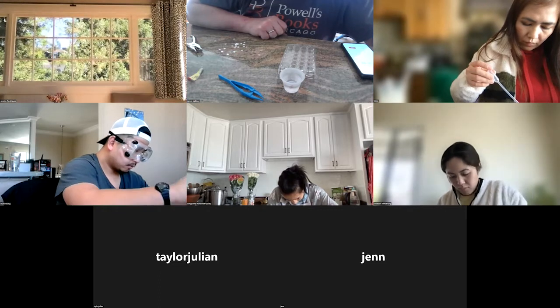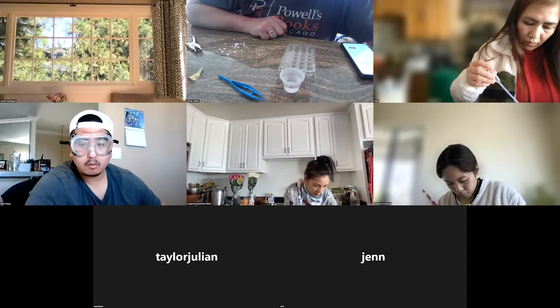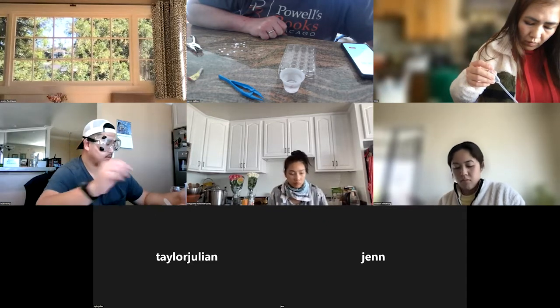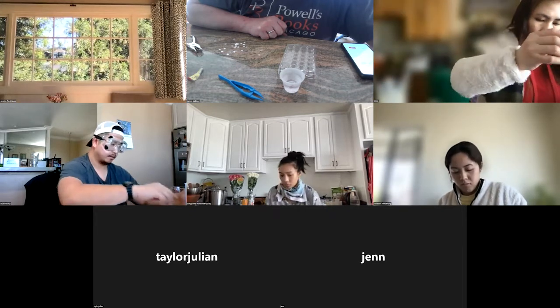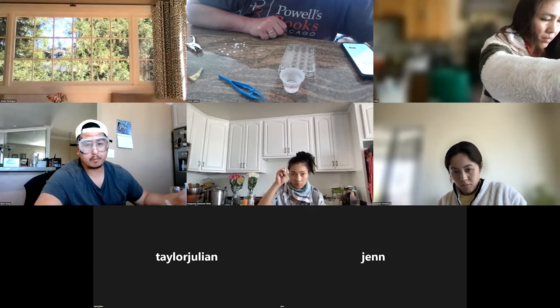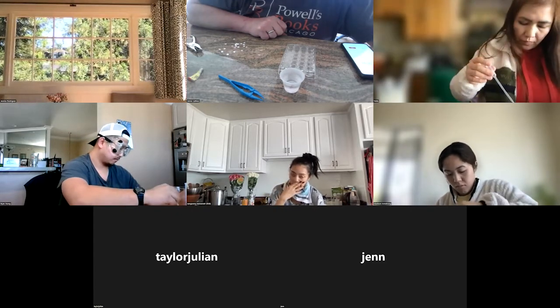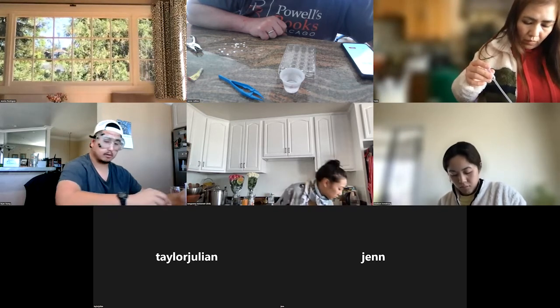Does anyone manage to get the 0% to float to the top at all? Mine, none of my trials floated. None of them? Nope. But how long did you leave them? 4 minutes. Okay. Yeah, I think that's kind of the point. Have you moved on to the 5%, Ryan?